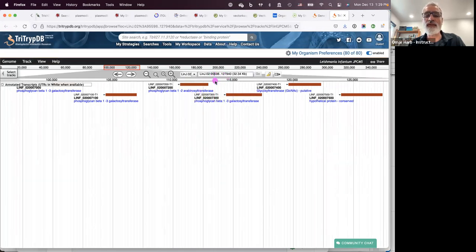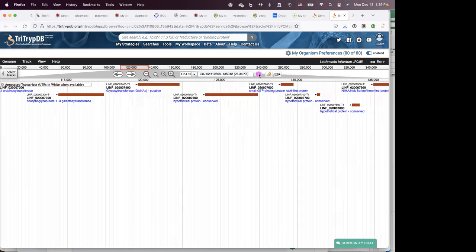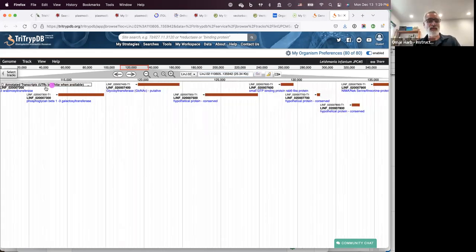And now what I can do is I can modify the numbers here. So I want to go from 110,000. And let's take this down here. And I think it was like 100 and I don't know, let's do 35,000. I'm just guessing now. And so now when you click on go, it's going to load everything in that region. And so then you could see all the genes that are in that region.